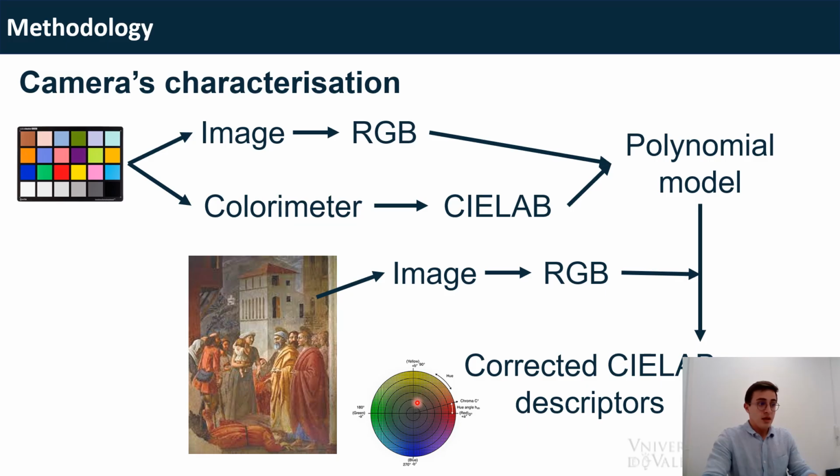So these are the reference values, and we will then have the images from which we can extract the RGB parameters. Of course, these RGB parameters are the ones that are influenced by those two variables that we were talking about. These RGB coordinates are actually influenced by the lighting environment, and by whatever the smartphone is doing.